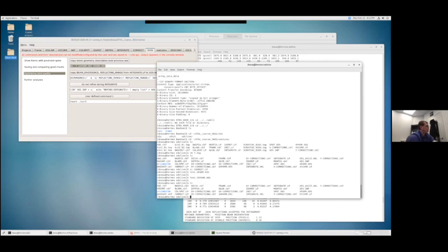And then the other files that you'll see are these .hkl files. So there's integrate.hkl and there's XDS_ASCII.hkl. Integrate is the list of spots, so they're HKL values.